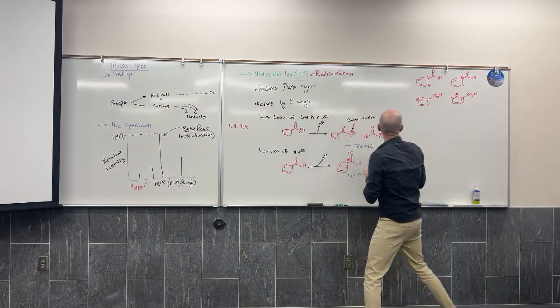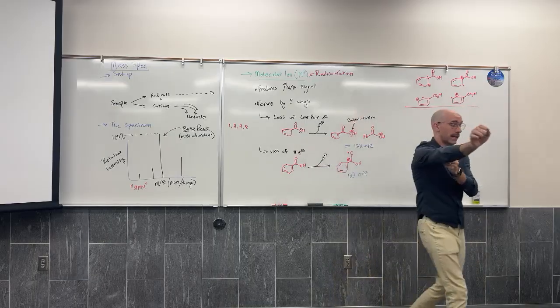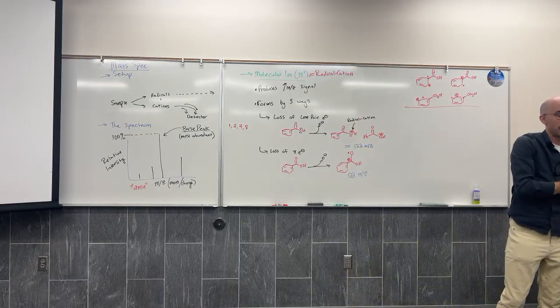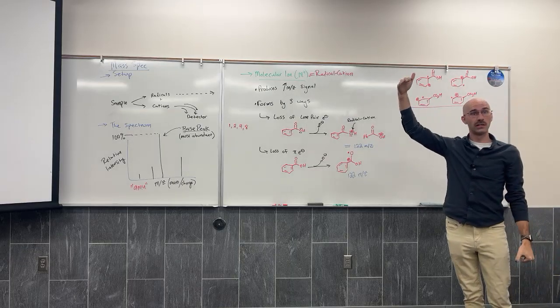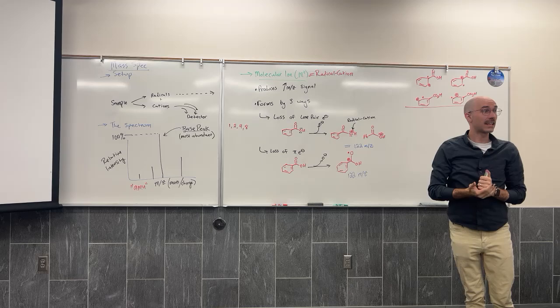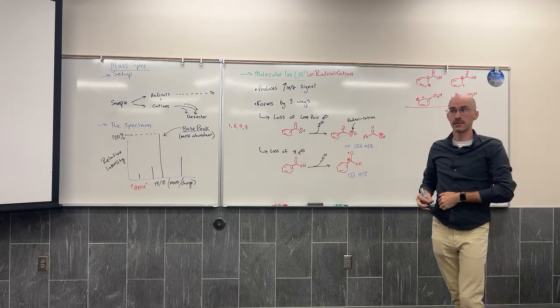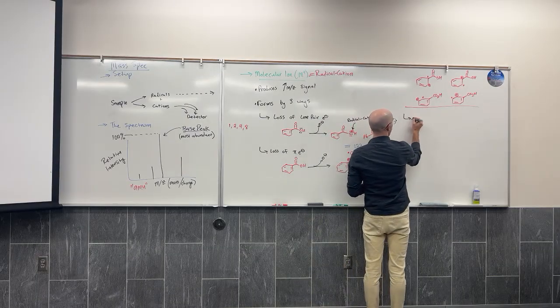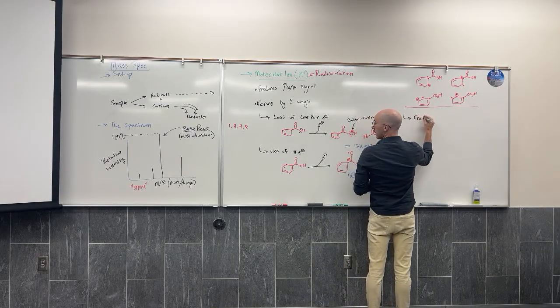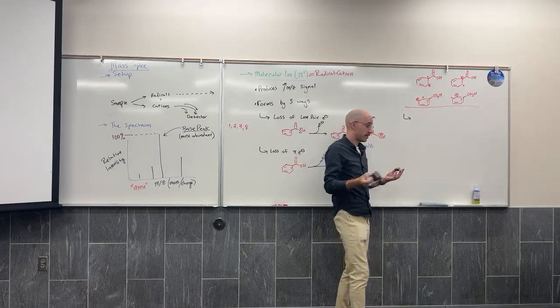All right, lots of possibilities there, which is one of the reasons why the molecular ion for benzoic acid is so tall: there are a lot of different ways that it can form. They all form and they all hit the detector and it gives a loud reading. The last way that I can form a molecular ion is by loss of a sigma electron.